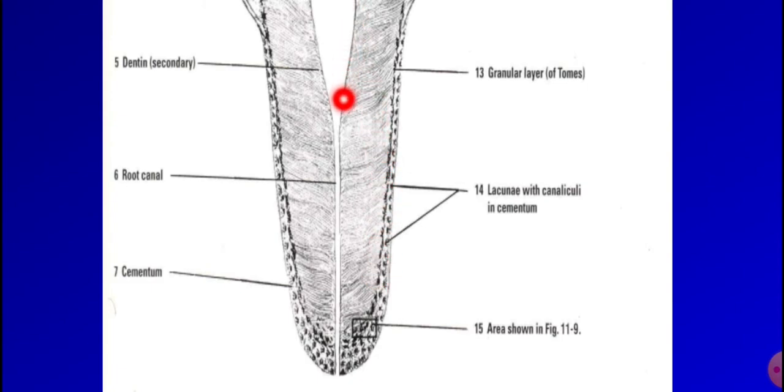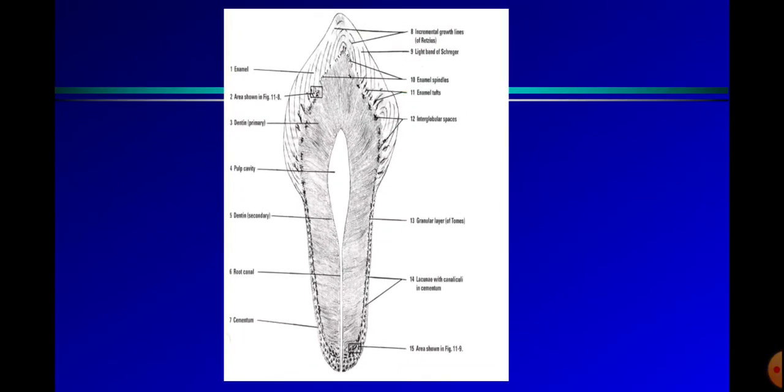At the junction of the pulp cavity and the dentine, here there is the layer of the odontoblast cells. These we have seen here, no? Cementum, root canal. Okay, so we'll identify all these features in the slide of the tooth here.